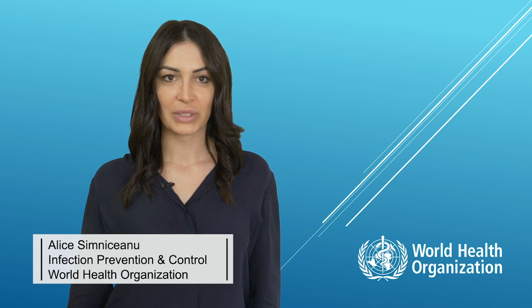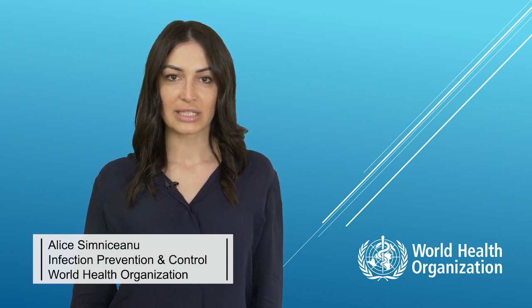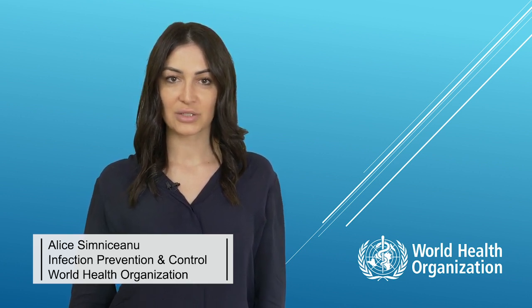And welcome to the Personal Protective Equipment training video. Based on the current available evidence, we know that COVID-19 virus is transmitted through droplet and contact transmission. Droplet transmission occurs when a person is in close contact with someone who has respiratory symptoms. Droplet transmission may also occur through the contaminated environment around the infected person. It can occur through indirect contact when an individual touches a contaminated surface and then their face.